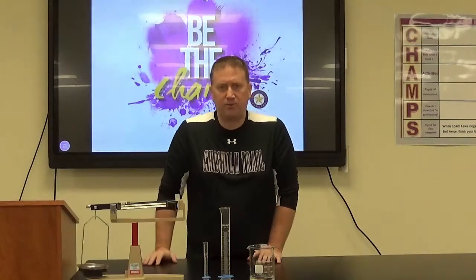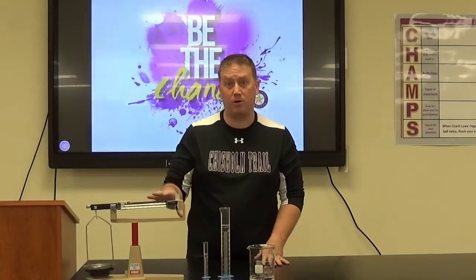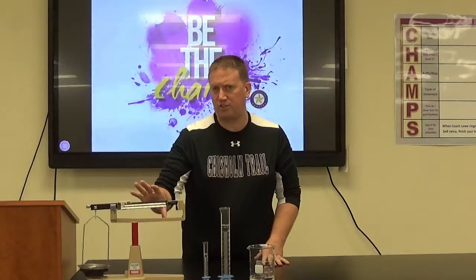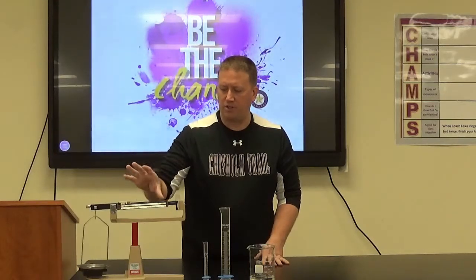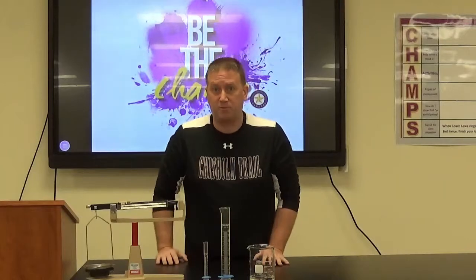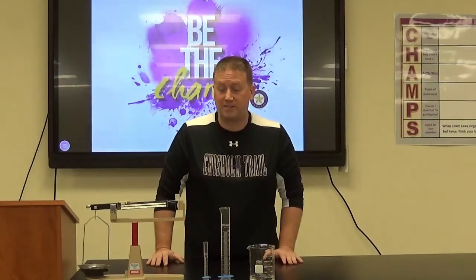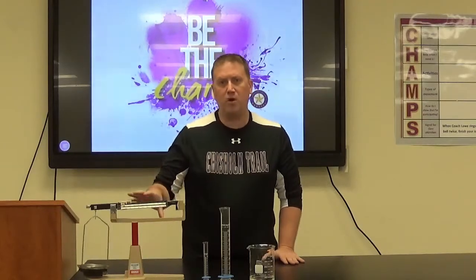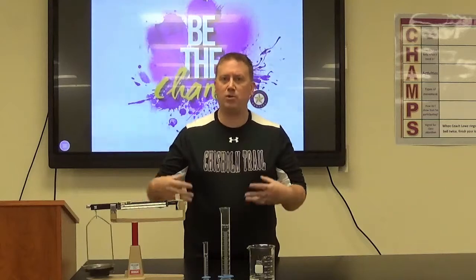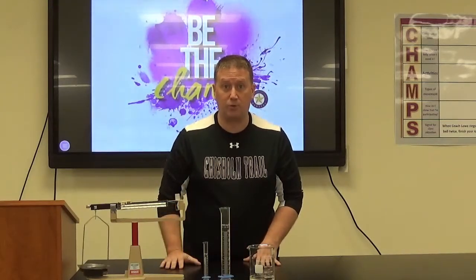This may look different from what you've used or what you've seen as a triple beam balance before, but this is just for demonstration right now. I want to show you how to, or review rather, because you should have used a triple beam balance before. You should have used all of these before in science classes, but I wanted to review how to use these, how to take measurements using these, and then we'll look at the precision of each of these pieces of equipment.